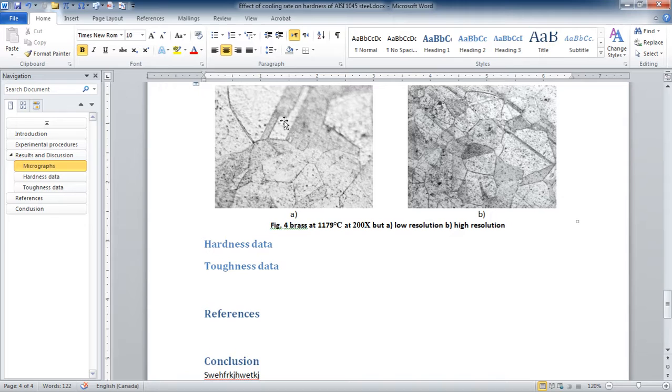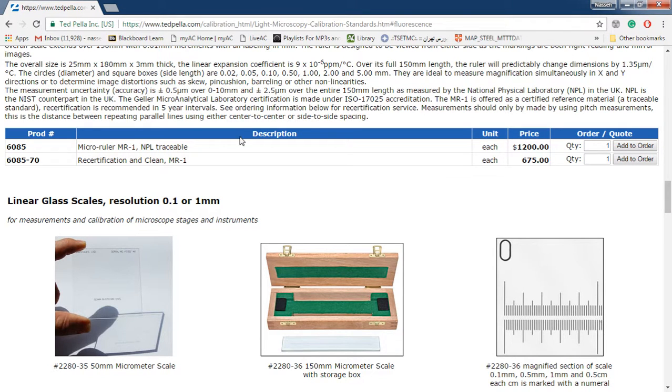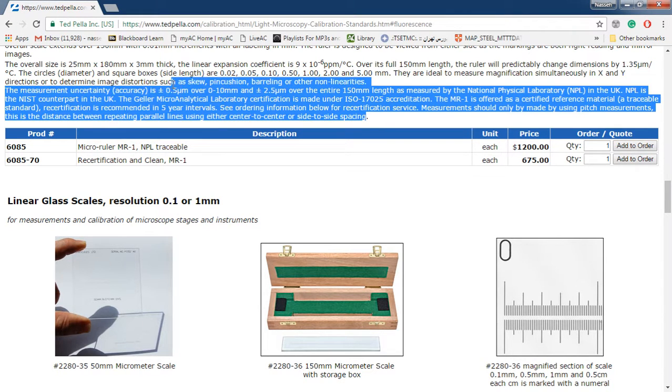Okay, so how do we do that? We're going to do that by using a software called ImageJ. There are many different softwares that you can use. Most of them are proprietary. Some of them come bundled with the microscope that you buy, but I've seen in many cases the microscope is an old microscope that you buy a camera and hook it up, and it doesn't have that software installed, or it doesn't work properly, or your microscope doesn't support the magnification settings and whatnot. It doesn't work. You're left alone. You have to find a way to put a scale bar.